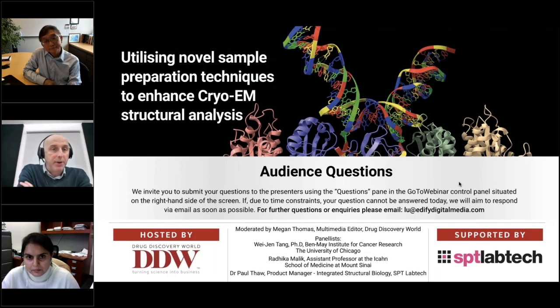Compared to the Vitrobot concentration, to couch this question, we're quite open about the fact that chameleon does need a little bit higher concentration than Vitrobots, and certainly the faster you go in terms of plunge speed, the more the concentration increases. We've recently published a couple of papers on this. Radhika, maybe if you want to go first this time, do you recall roughly how much more concentration you needed above your Vitrobot concentration? Sure, Paul.